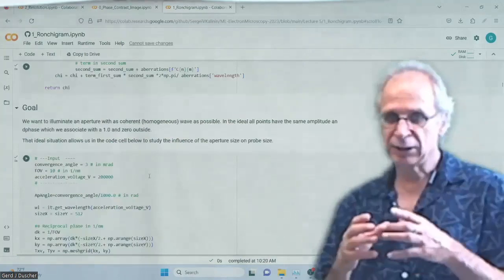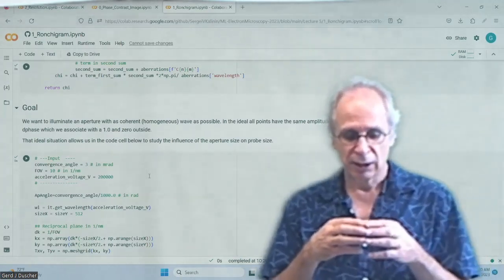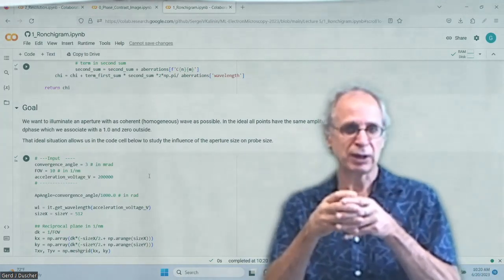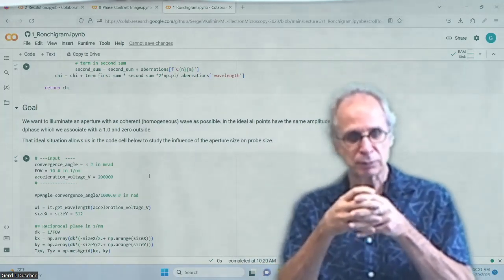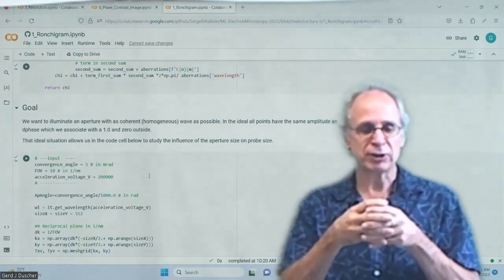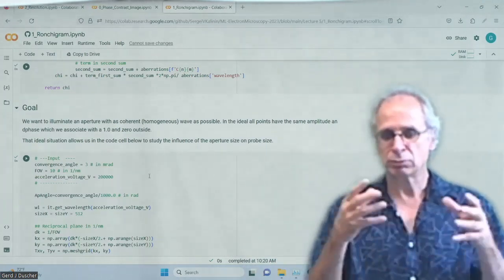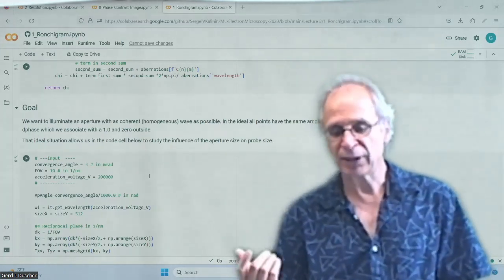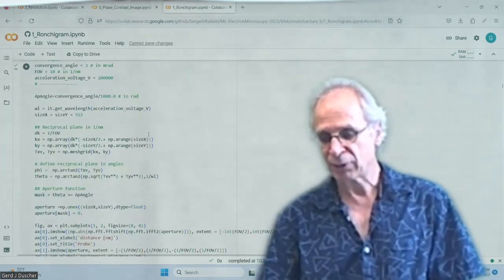And with an aberration function that is very well aligned, what we want to do is create a very large coherent patch in reciprocal space. So that's an infinite magnification, and of an amorphous material that gives us an image of our coherence, and any kind of aberrations, any kind of instabilities will kill this coherence. So that's why we want to do that. So we can look at that.